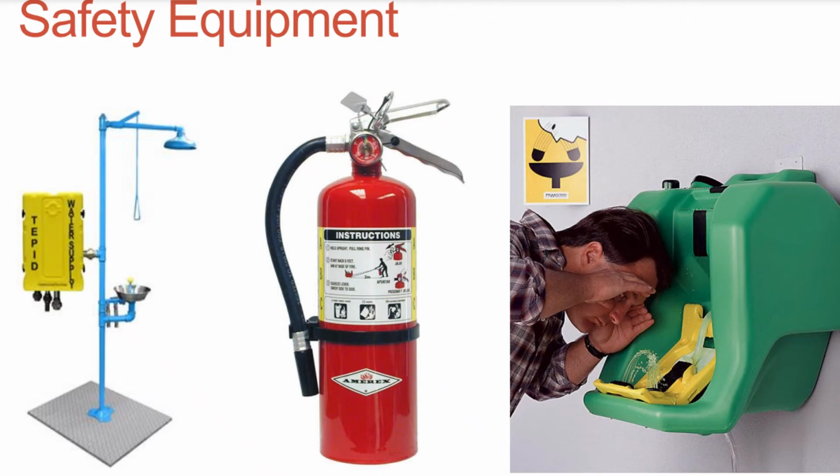While the eye wash stations must be accessible, within 100 feet in laboratory areas presenting chemical or biological exposure hazards. Other items that must be available for personnel include fire blankets, spill kits, and first aid supplies.